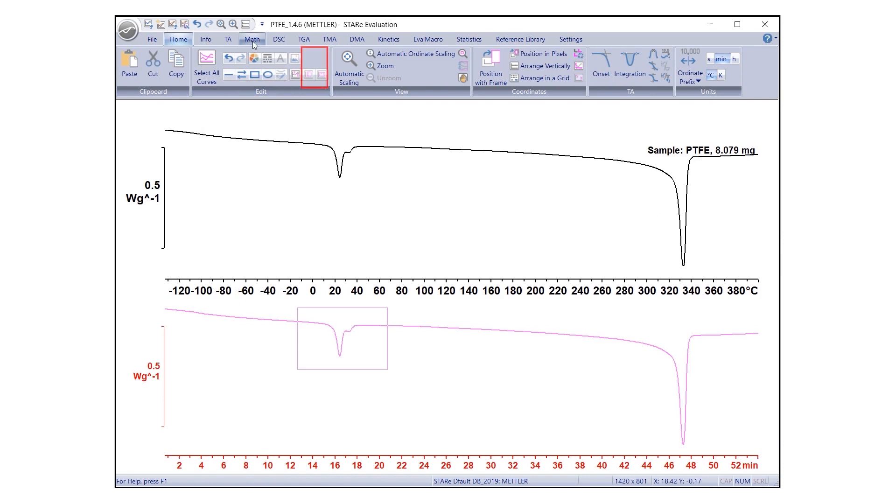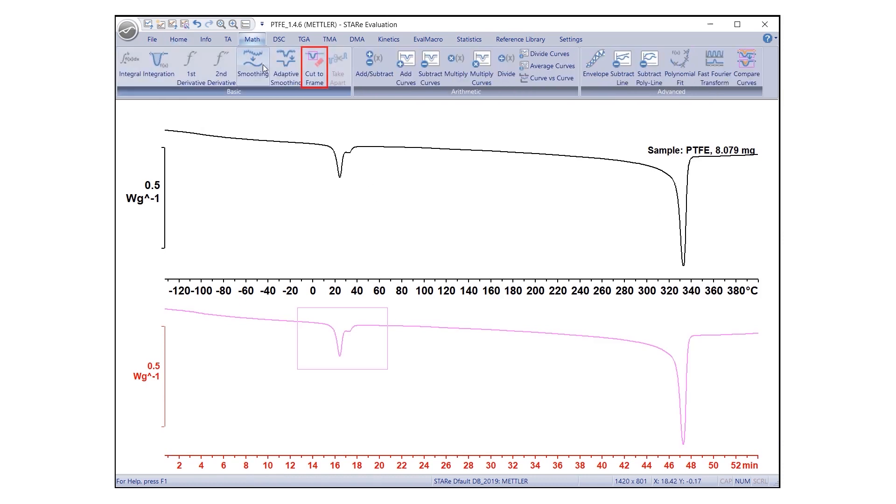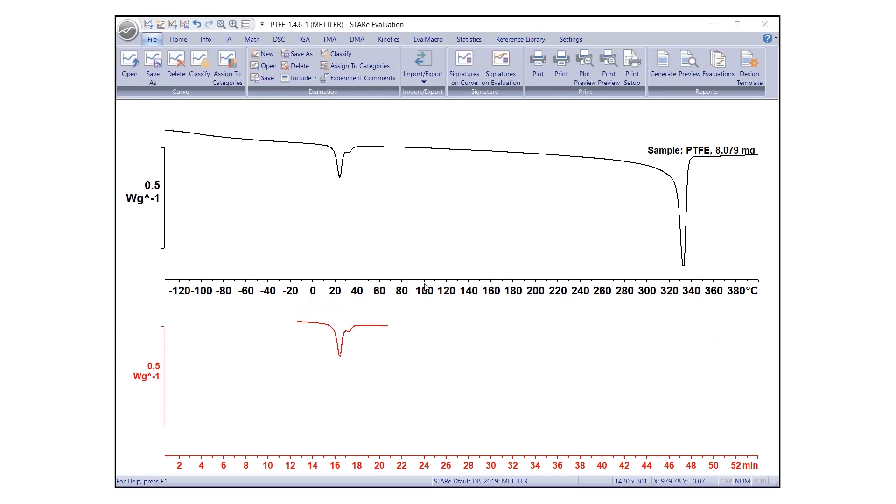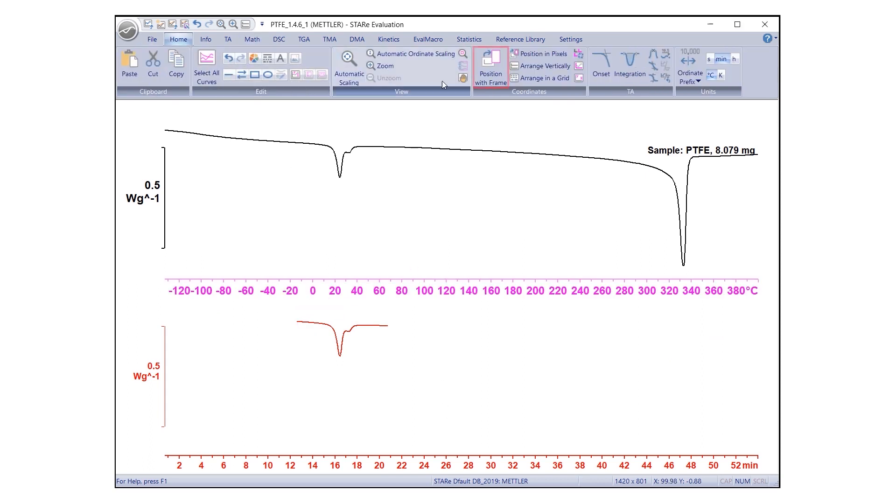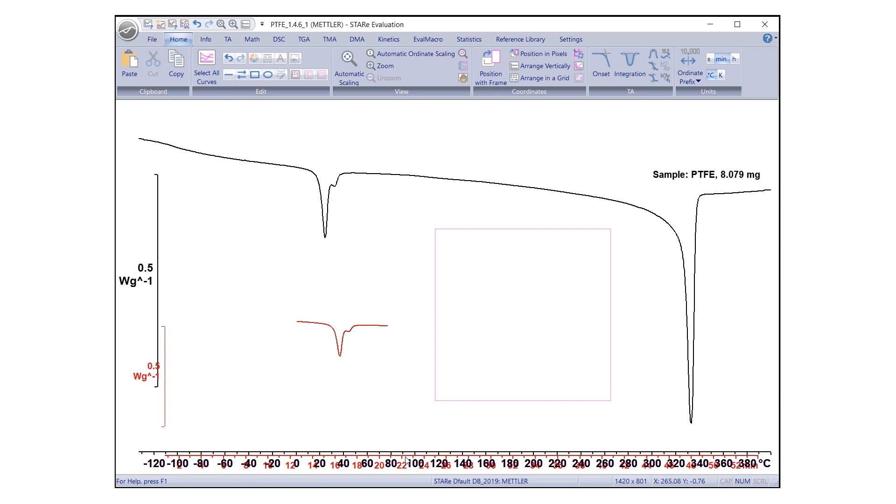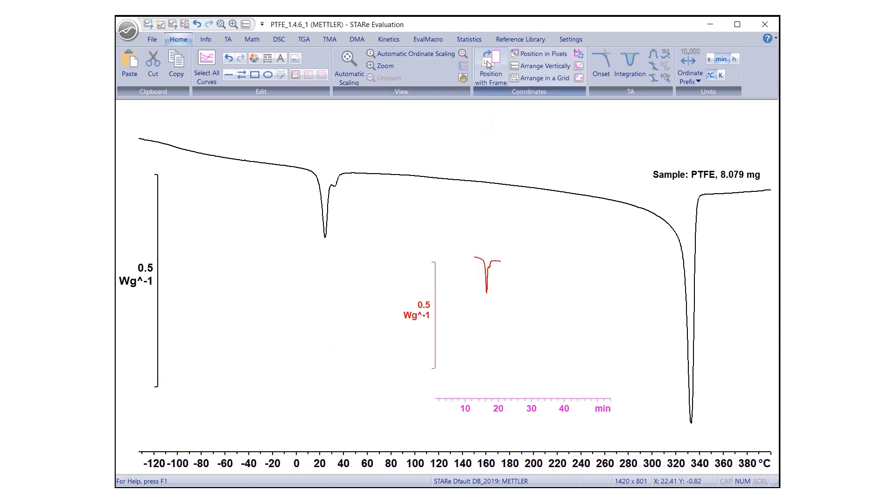Then, under the tab Math, select the Cut to Frame icon. Select the original curve and click on Position with Frame. Draw a smaller frame and select the cropped curve with Control tab. Click on Position with Frame. The cropped section of the curve is shown in the smaller frame.